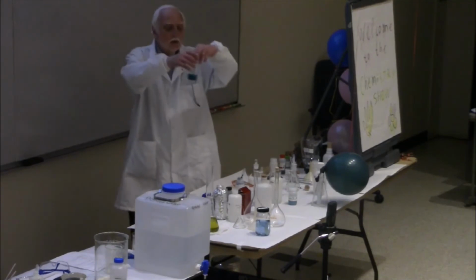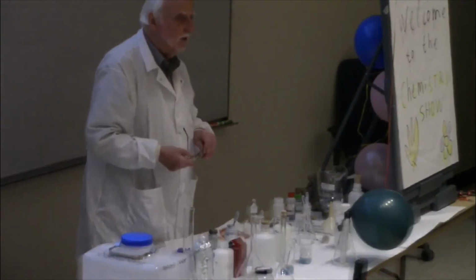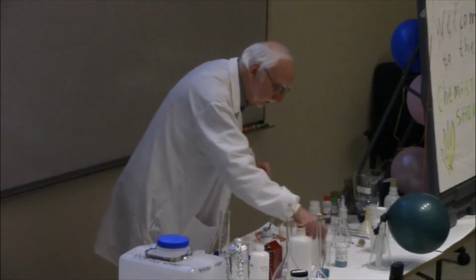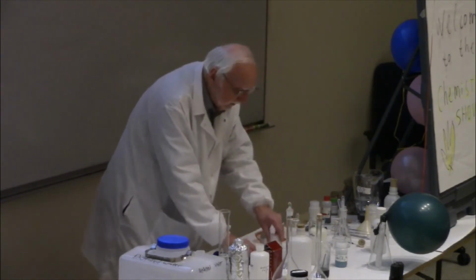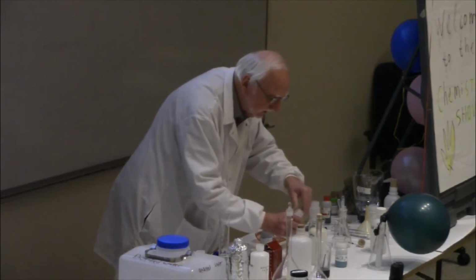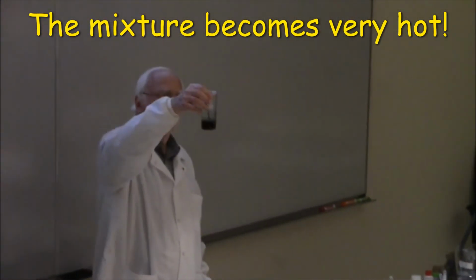And you see when I put the zinc in, nothing much happens, because it's a very bulky, solid piece of zinc. But in this bottle I have some zinc. It's a very fine powder. Let's see what happens when I add that. Let's add a little more of this. You see, when I add the fine powder, it reacts very quickly. And copper metal is deposited.